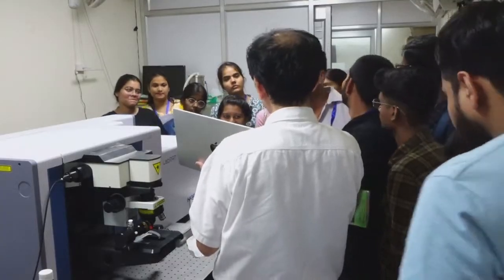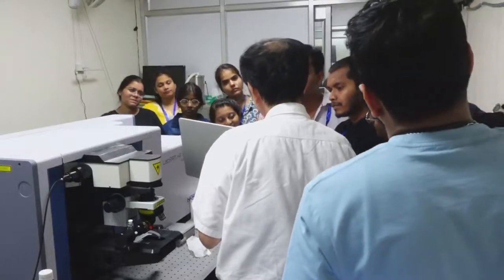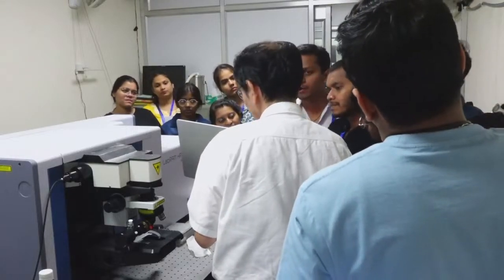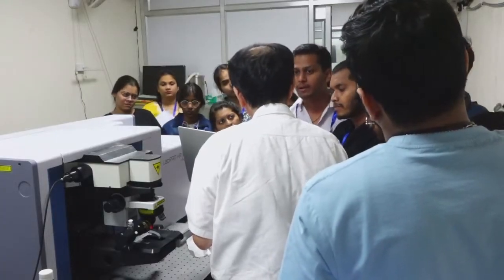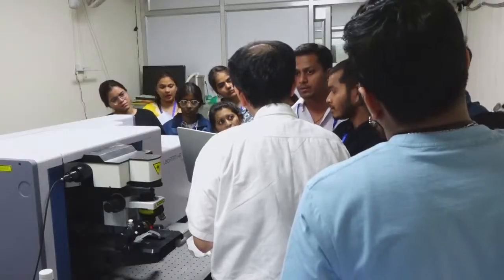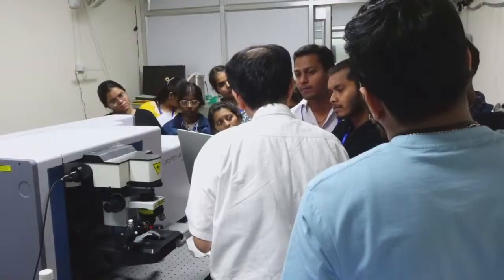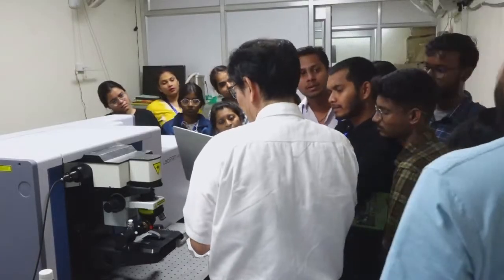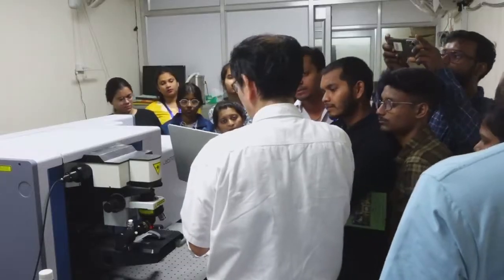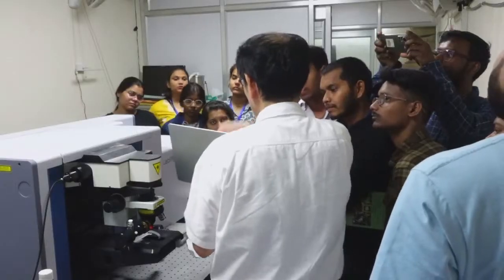One thing is, when we want to take Raman imaging spectra, how can this be achieved? Raman imaging spectra, if we want to see APIs in a tablet, how can we see them? If you do the imaging, then you can gather this kind of data at each position.